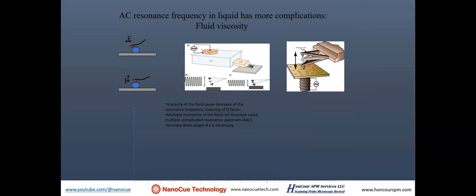I need to mention some of the advanced imaging modes that Agilent developed. In this case, the magnetic-driven AC mode. When we oscillate the tip using a piezo driver, the piezo not only oscillates the tip, it also oscillates your ambient environment. In other words, it causes a lot of sonication of your sample.